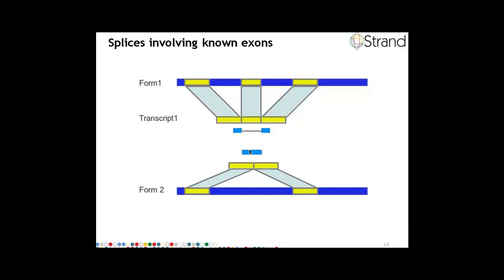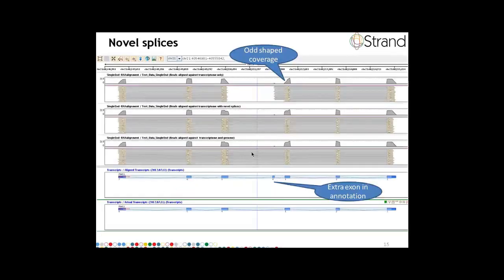Some specialized tool is needed, and that tool would have to break this particular read into 2 parts and try to figure out for each part what is the possible exon from which it arose. So this is what we call aligning against the transcriptome, but detecting novel splice forms. And Avadis NGS supports this particular feature.